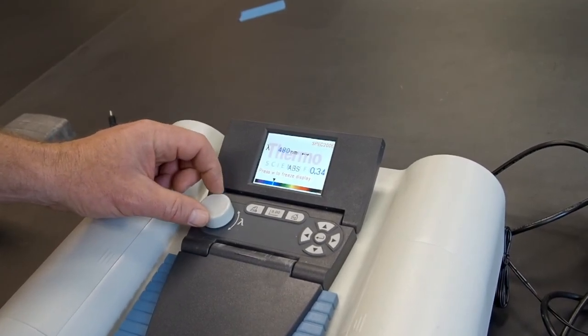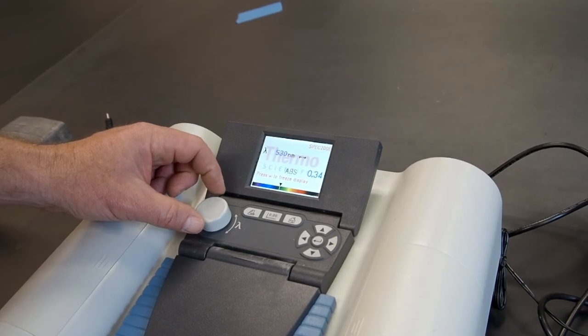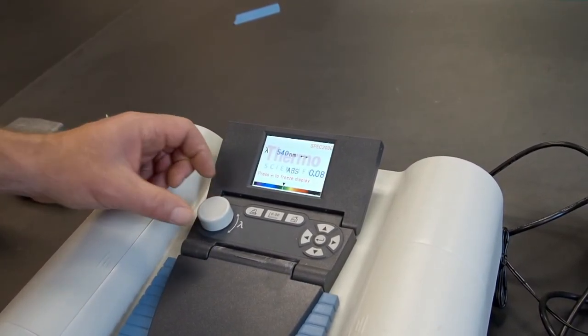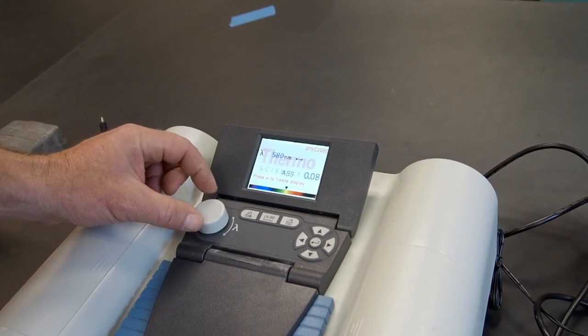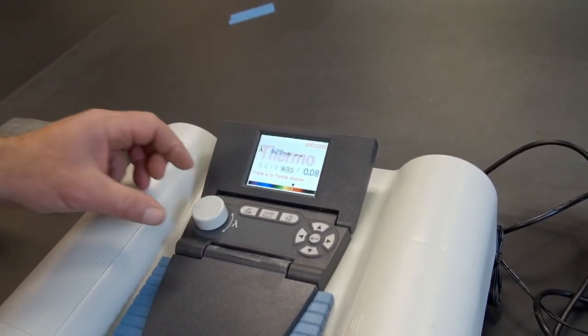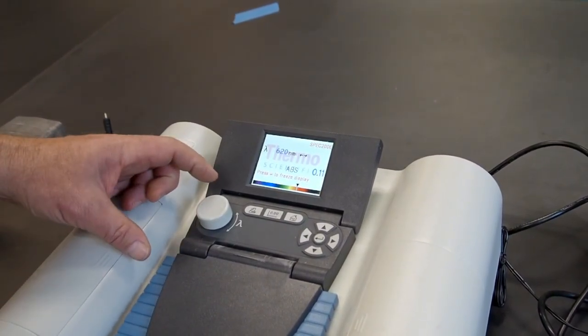So if we change the settings here up into green, we should see things change. All right, now there's very little absorption at those wavelengths because that light is reflected. And if we go even farther up into the higher wavelengths of light, that represent yellow, orange, and red, we should see an increase in the amount of absorption.